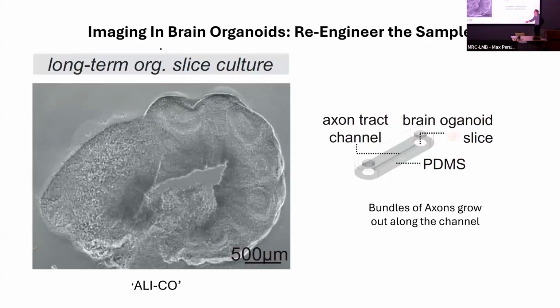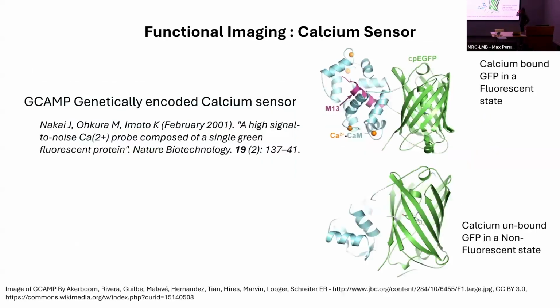They then put that thing into a micro-patterned sample chamber. And the question they're trying to look at is, do the neuronal bundles that they see in these objects exhibit coordinated activity? Because that's a sign that this thing is doing something other than just growing. And the other thing that they do is they're doing functional imaging. They put in a genetically encoded calcium sensor.